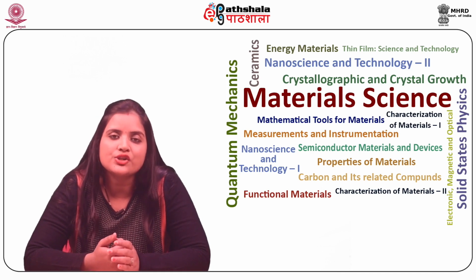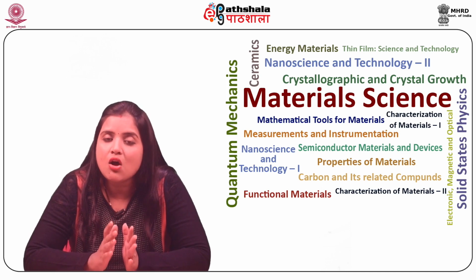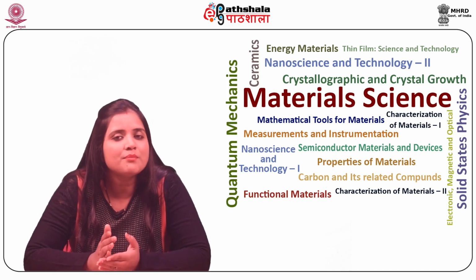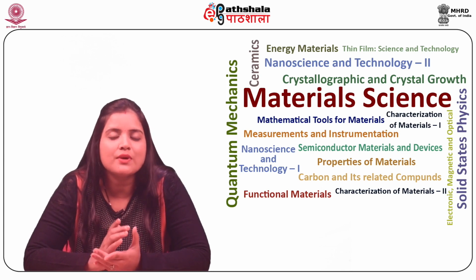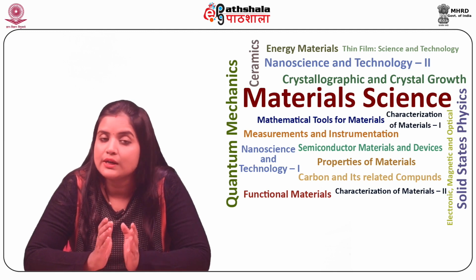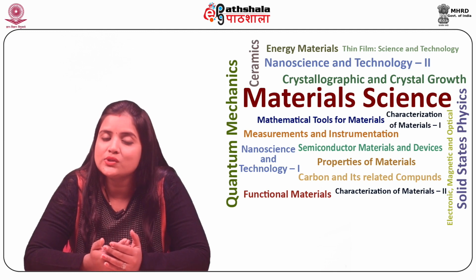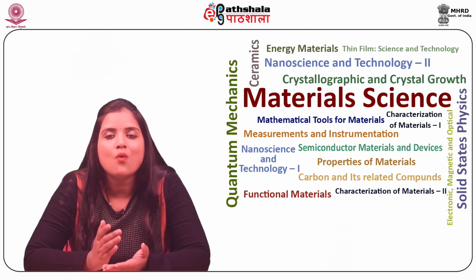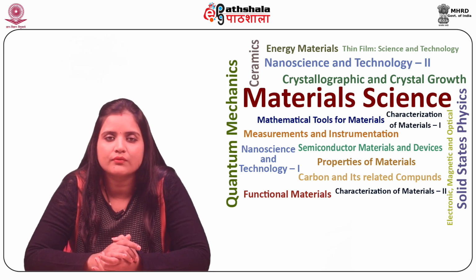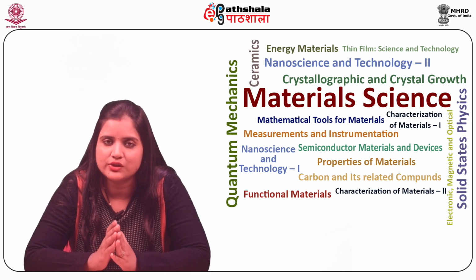The second application is surface 3D topography. Analogous to other 3D optical profilometers, DHM performs static measurements of three-dimensional surface topography. It has been applied to a wide range of samples including medical implants, watch components, micro-optics, etc. Third is the time resolved applications.